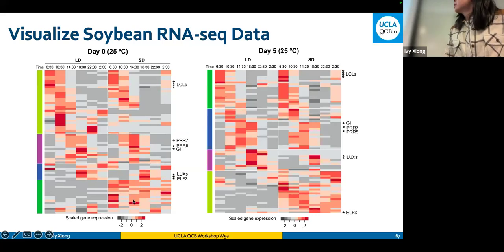You can start to see that in different conditions, they have slightly different patterns. For example, this chunk seems to be highly expressed only in short day exposure to sunlight and not so much in long day exposure. Some early-peaking genes seem to lose their expression in short day exposure. Then we can mark individual genes that we are interested in, such as a few genes involved in flowering and circadian rhythm. And of course, we can also compare across different days due to treatment effect.